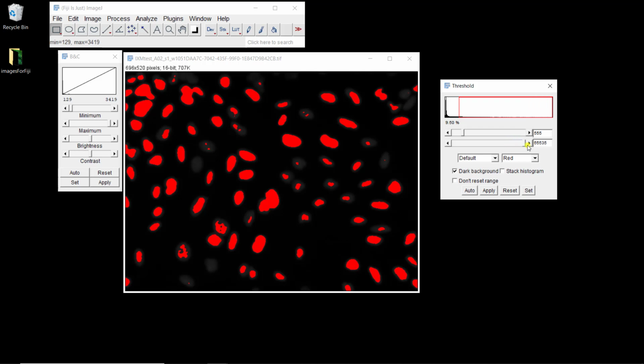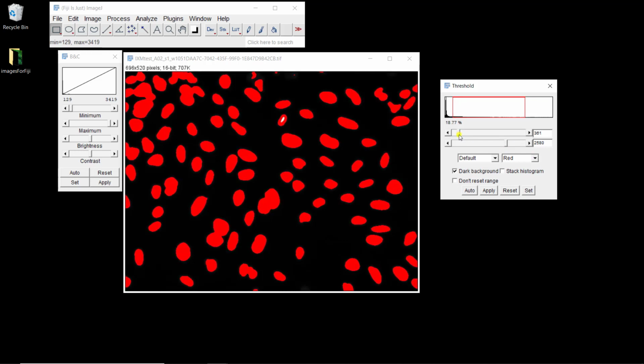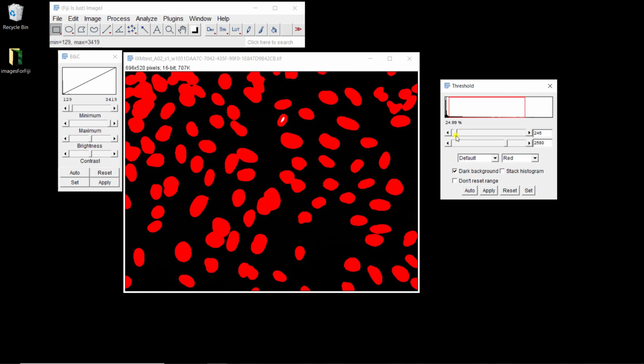So this one, we're going to put it at the maximum, and then we're going to play with this one to actually find a threshold that allows us to extract everything. Oh, and this came back here, sorry. Okay. So this is a very low threshold, but the background, as you see, as we applied the Gaussian filter, the background is really smooth, so we can have something that is pretty low. You can still see, so this is the histogram, so you can have an idea how to use that.